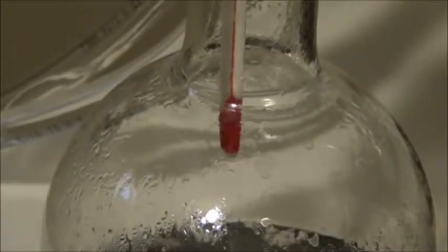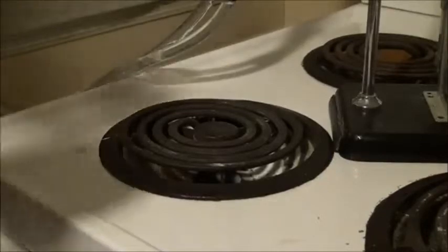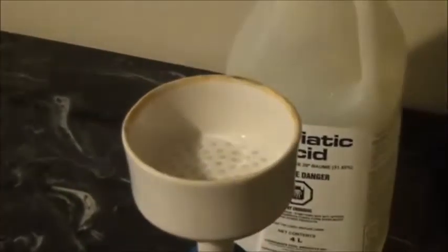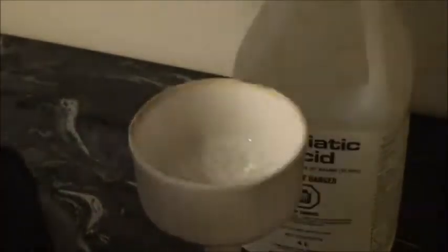You can see the salicylic acid as very long, needle-like crystals. You can sort of see it here, but it was hard to get a good shot of it, but you'll see it more clearly later.